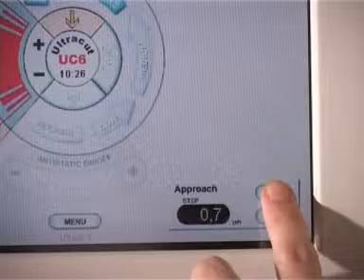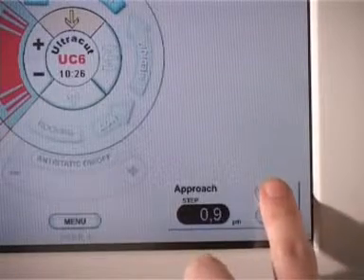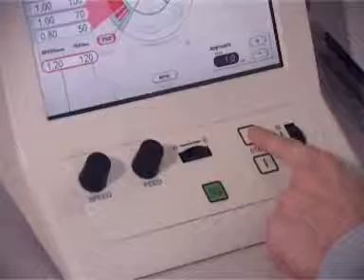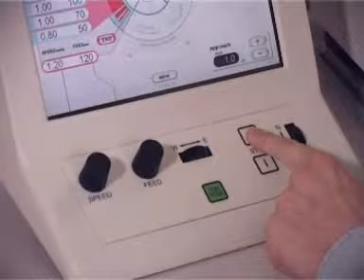The backlight is switched on and the upper part of the knife block is swiveled to the zero position. A wedge-shaped gap indicates misalignment and can be corrected by rotating the knife using the knobs of the precision drive.